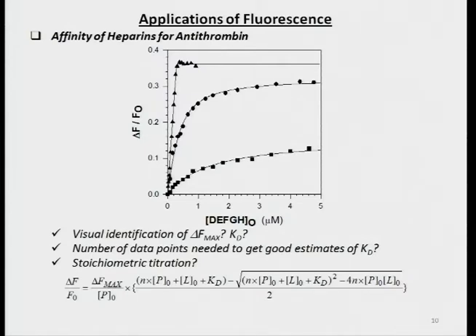So the electrostatics changes. The oxygen, nitrogen, hydrogen, carbon don't have to undergo a change such as oxidation or reduction. Nothing of this sort has to happen. They simply have to bind. That change in electrostatics is what the S1 transitions reflect: they are different states now, and therefore it can be monitored, going from this process to this process.